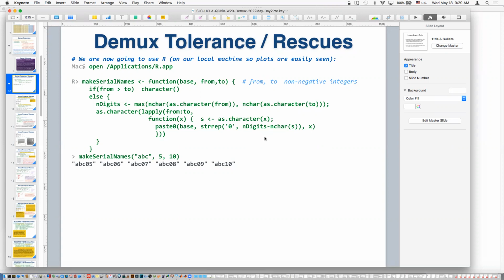So the basic idea is, if there are big gains in recovery that don't push the tolerance very high. If you're going from 0 mismatch to 1 mismatch and you get a big gain in recoverability, you're probably going to want that gain. Between 1 mismatch and 2 mismatch, you have to judge whether that gain in recovery is worth it. But it would take a special instance to go from 1 mismatch tolerance to 3 mismatch tolerance. Something would have to be amazing in terms of recovery.